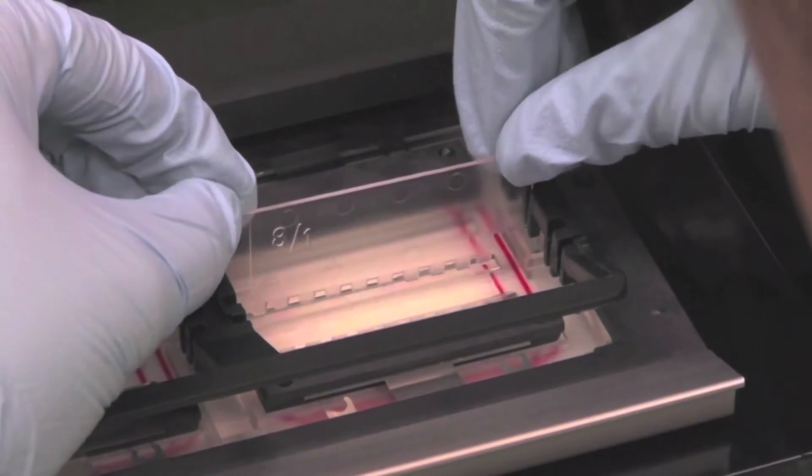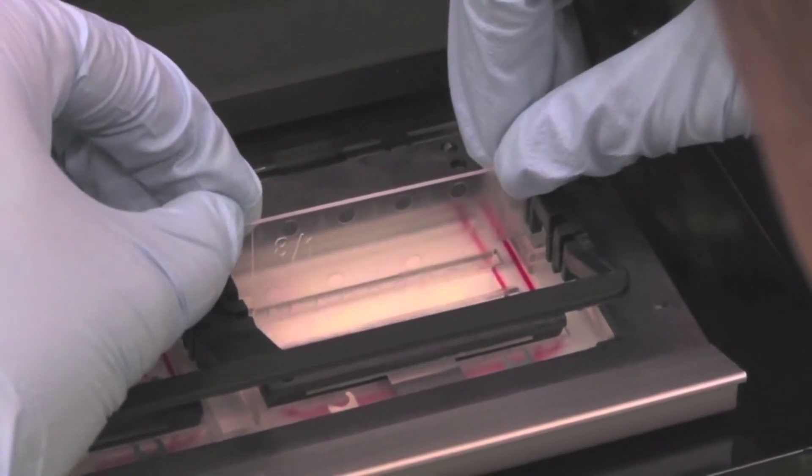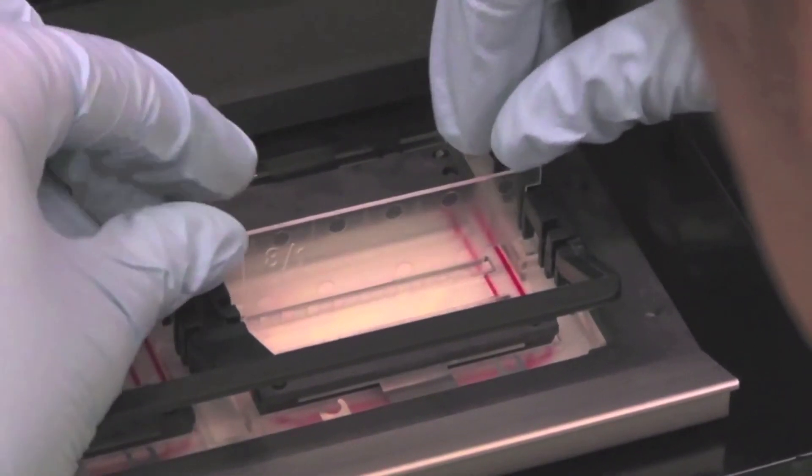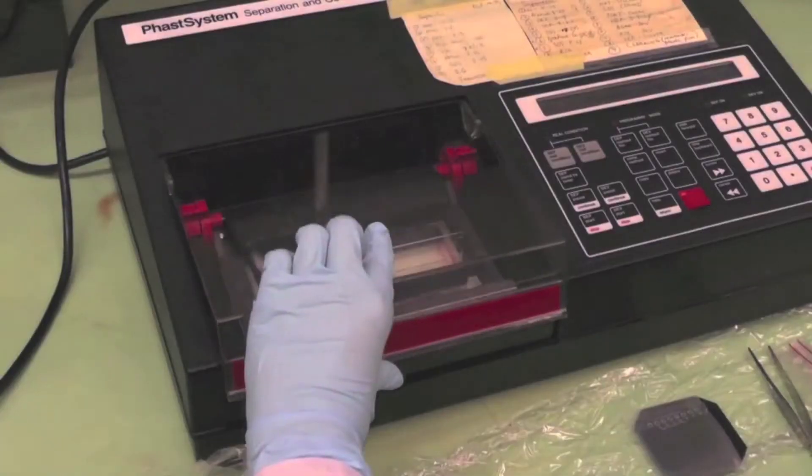Open the cover of the FAST system and gently place the sample applicator in the middle slot of the sample applicator arm and close the cover.